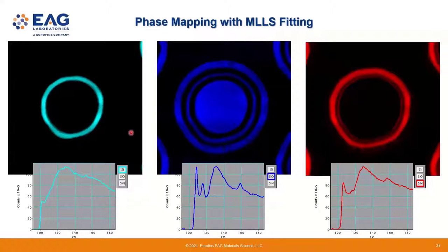And then once you get this reference spectra, you can do the multiple linear least squares fitting, right? Again, this data is basically from the simultaneous high-low loss EELS mapping, right? You can use high loss, for example, the silicon K edge at 1800 eV, to do the elemental mapping, and then if you want to confirm the bonding, most of the time the L edge will have a better signal to noise ratio for this kind of analysis.